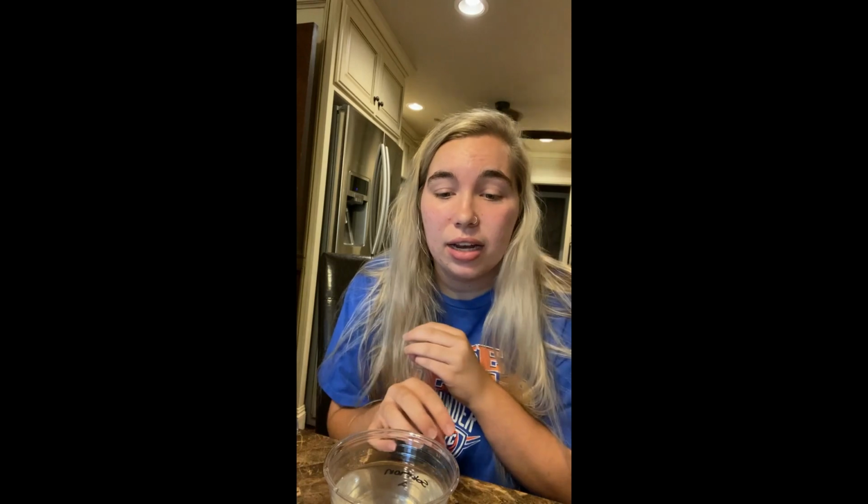Okay, so the update. After several minutes, my experiment still hadn't changed colors. So I tried a few of the techniques that he talked about in the video. I changed the temperature, heated it up to see it change faster. That didn't work. I changed the concentration, so I added a little bit of iodine because he said that would make the color change happen a little faster. It didn't work when I did it, and then I mixed them differently.